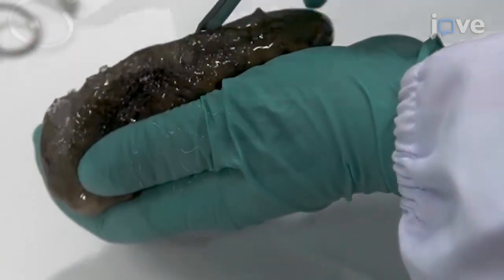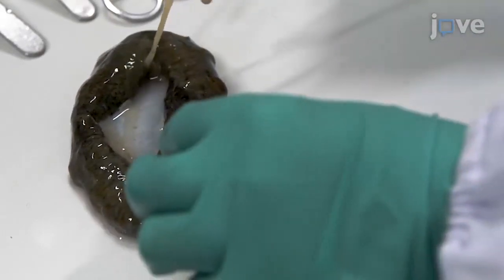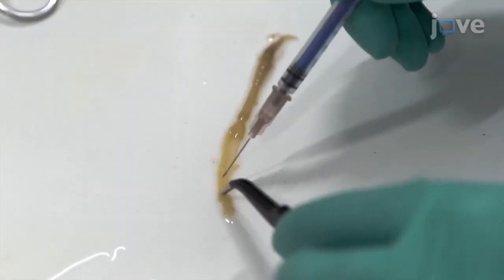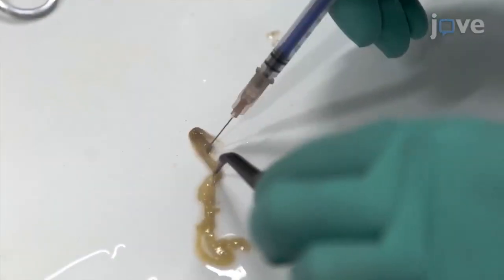After anesthetization, dissect and collect the anterior intestines, then section the tissue samples vertically and remove the inner contents.